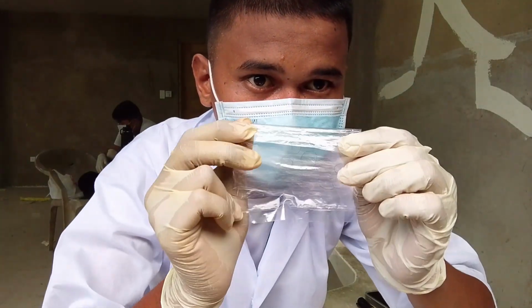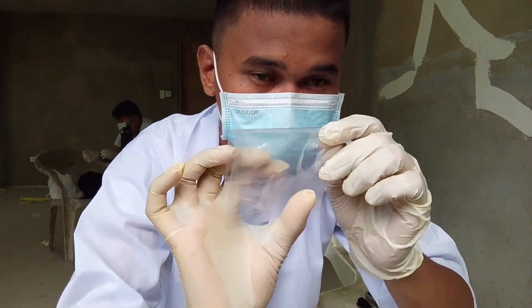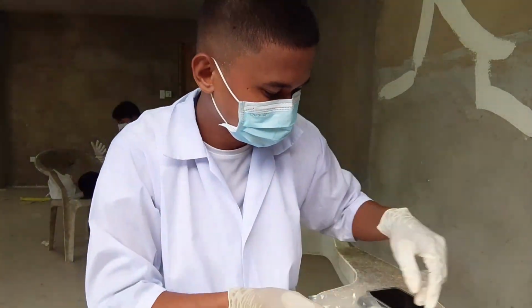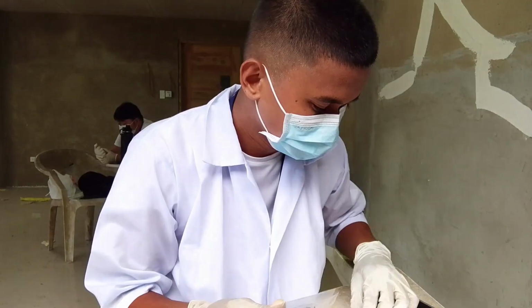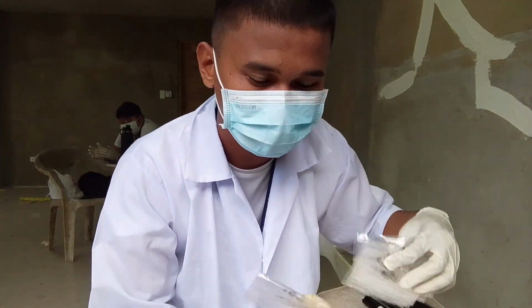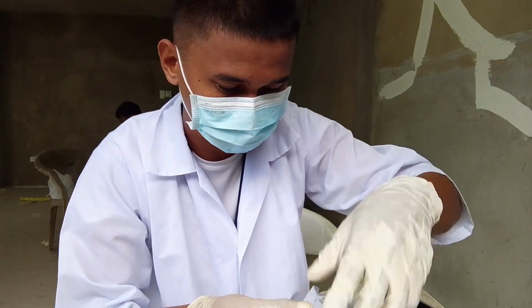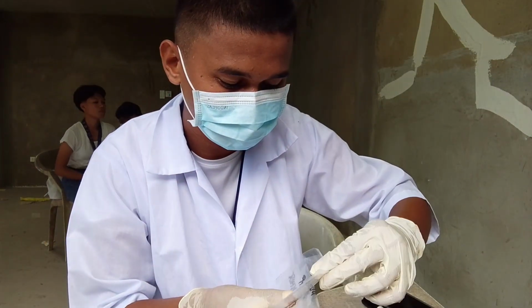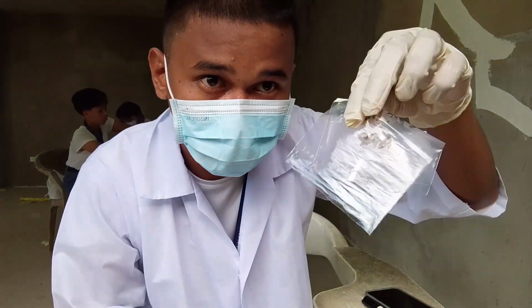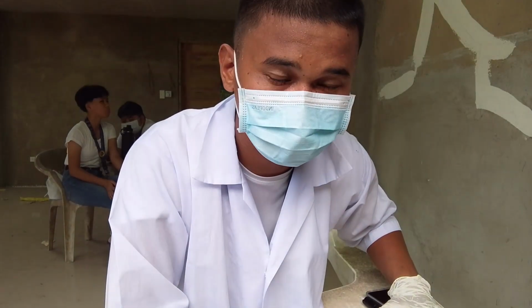I am done collecting the leg hair of a human. I will now label it to avoid alterations. I am done collecting and labeling the leg hair, so I am done collecting the human hair. I have here the pubic hair, the armpit hair, the nose hair, the eyelash hair, the eyebrow, the head hair, and the leg hair. I am done collecting the different kinds of human hair.